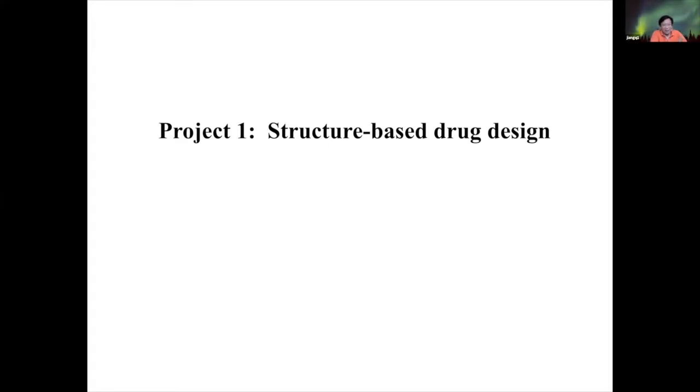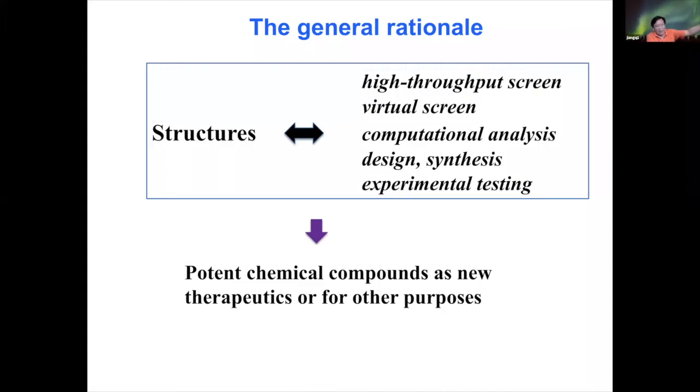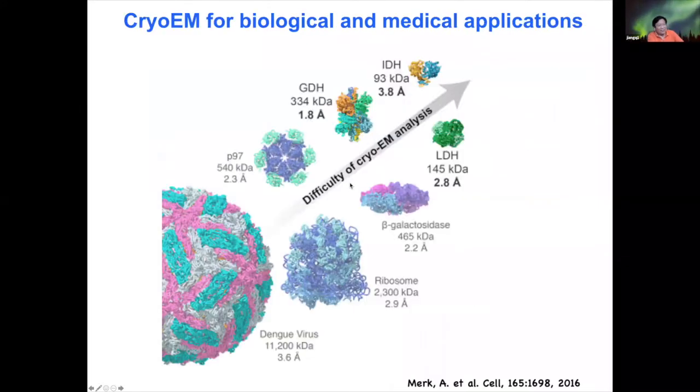In the next, I will show you 4 different directions. The first is the structure-based drug design. The general idea is, for X-ray crystals, this has been done for a long time. We can integrate the Cryo-EM structures at near atomic or atomic resolutions into the pipeline so that we can use the structure to optimize chemical compounds for biological complexes. This has been actually proposed a few years back.